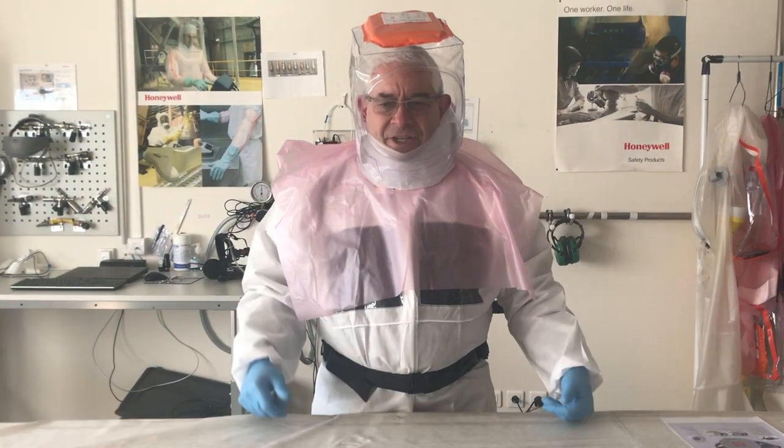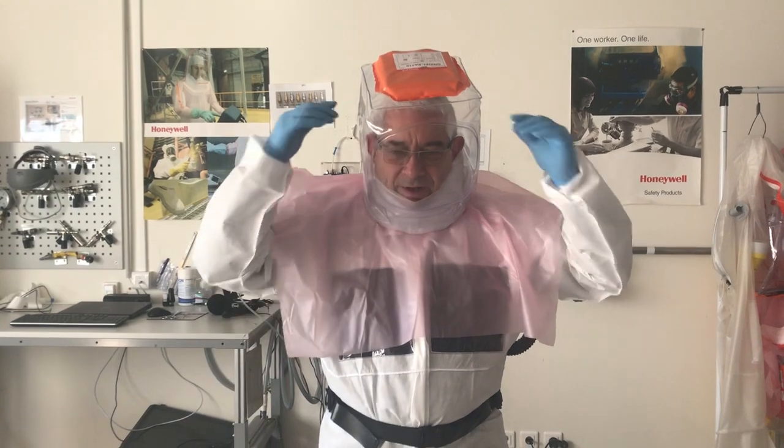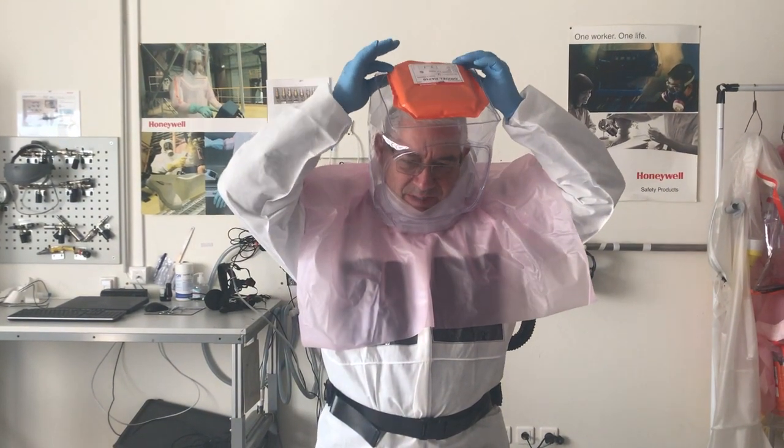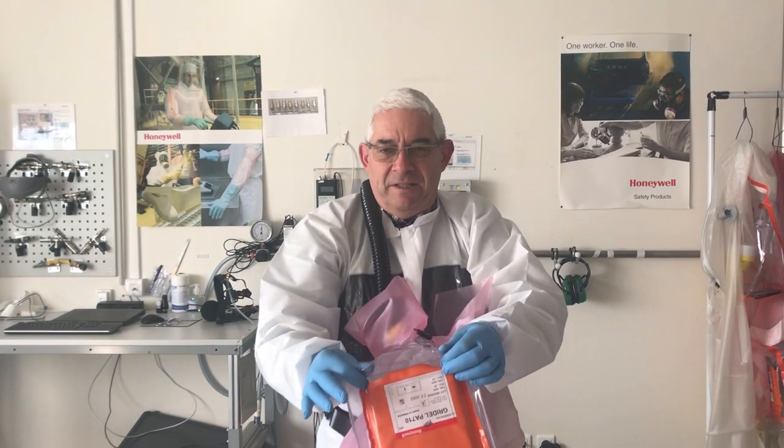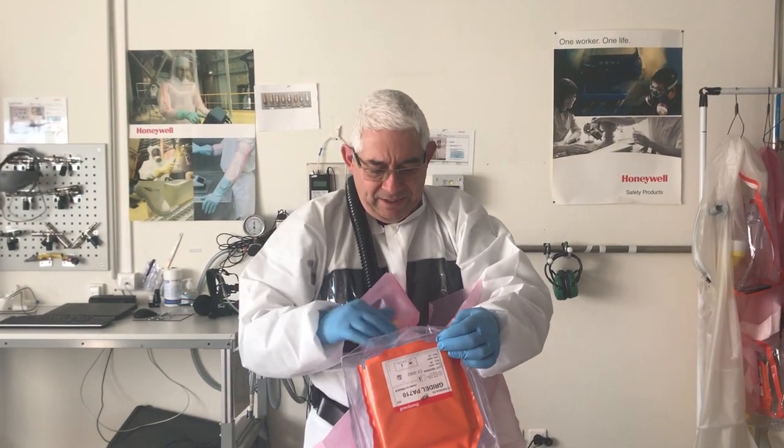You get fresh air and a very high protection factor. To remove it, you take from the back to the front. As you can see, it is easy to undress as well, even with spectacles.